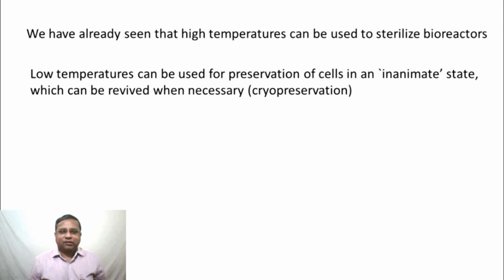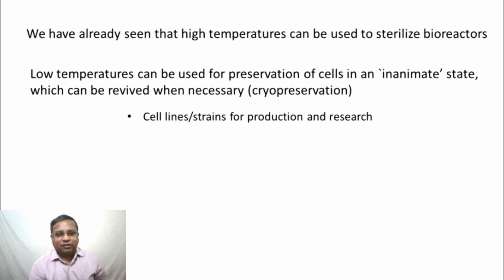Okay. Such a process is actually called cryopreservation. You might ask, where is it really relevant? Why do you want to preserve cells? It's a very common question. If you think about it, it becomes very necessary. There are so many cell lines and strains that are used for production and research, some of which have been modified for a certain purpose and so on. And how do you ensure that goes on, right?